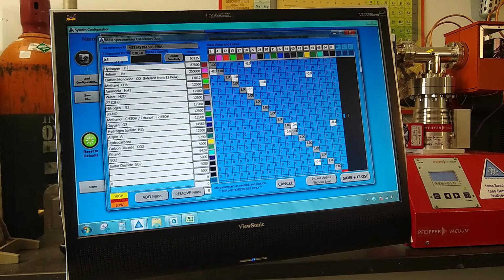We've found our unit to be particularly stable over the past decade of operation and very little need to adjust the sensitivities. This also has our interpreter matrix, which allows us to configure various gas species that we're interested in analyzing. We can add or subtract from these species, and we can configure specifically what we're interested in looking at and how that is presented onto the screen.